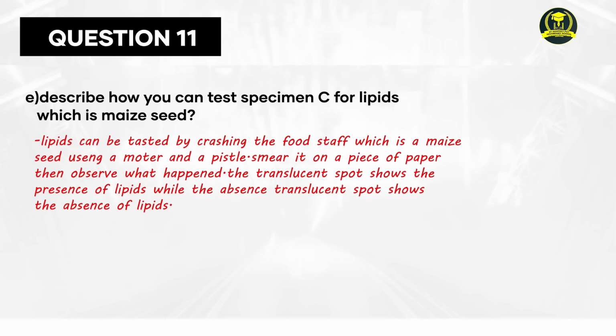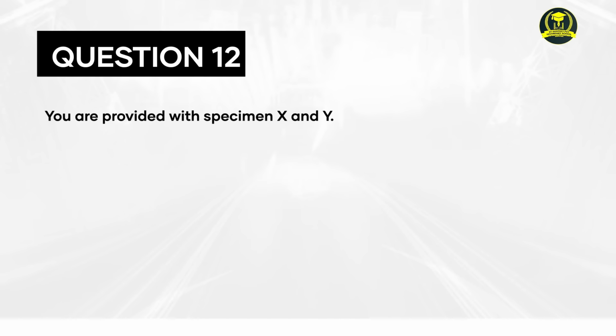Smear it on a plain paper. Then observe what happened. The translucent spot shows presence of lipids, while the absence of translucent spot shows the absence of lipids.